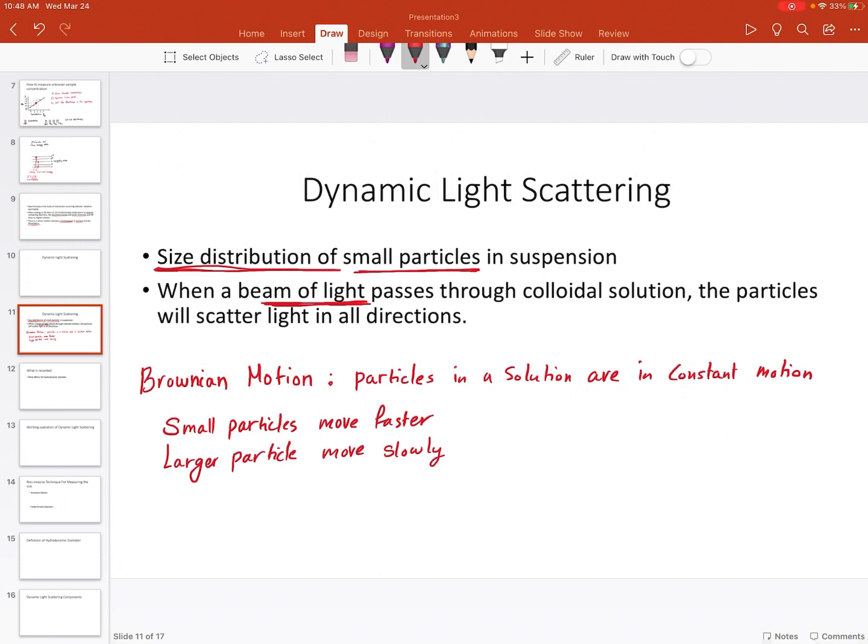Now, the source of illumination, as we mentioned, is light, which is actually a laser, which is concentrated light. We are exposing that sample solution, let's say we have some gold nanoparticles. This is a cuvette, a glass cuvette that we use in the dynamic light scattering, and we have some gold nanoparticles that are distributed in our solution.